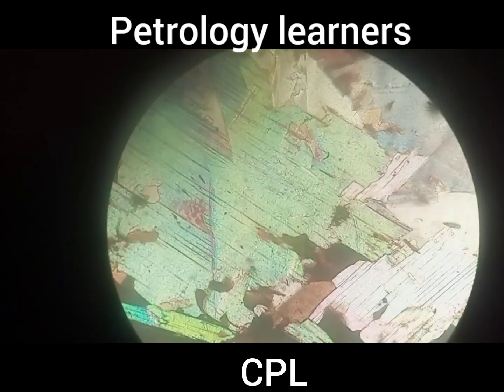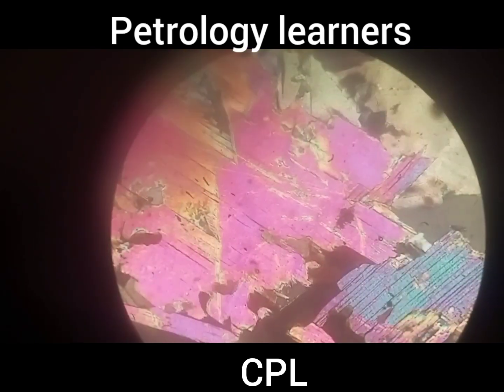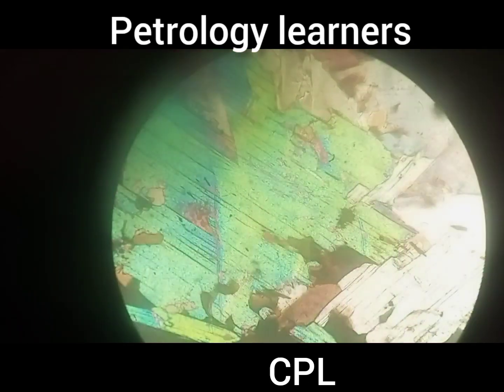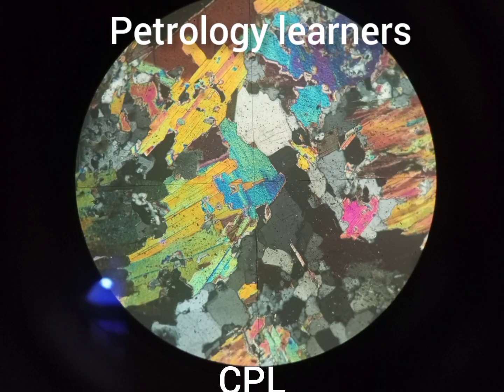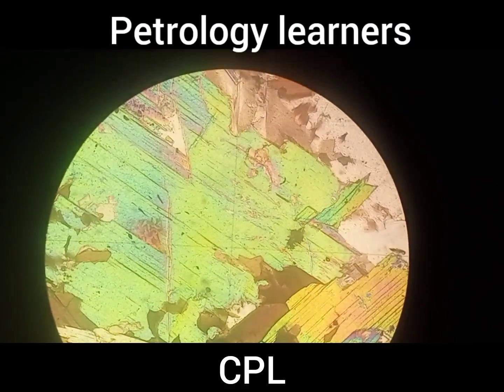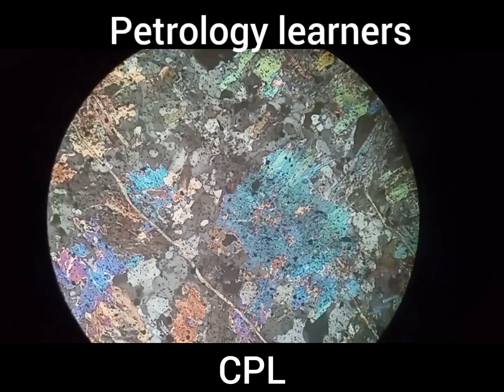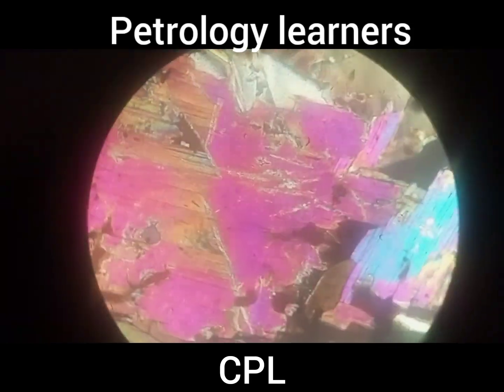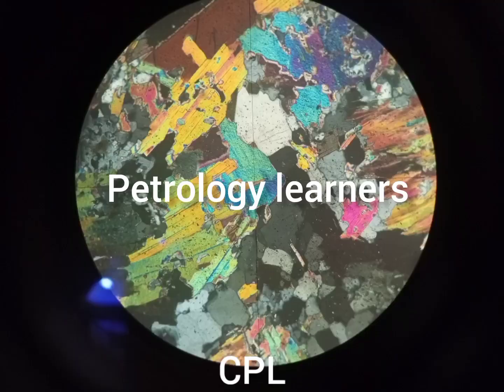On rotation of the stage in cross polarized light, it can show yellow, blue, orange, pink, and even green colors. Muscovite shows second order interference colors, which are moderate to high.